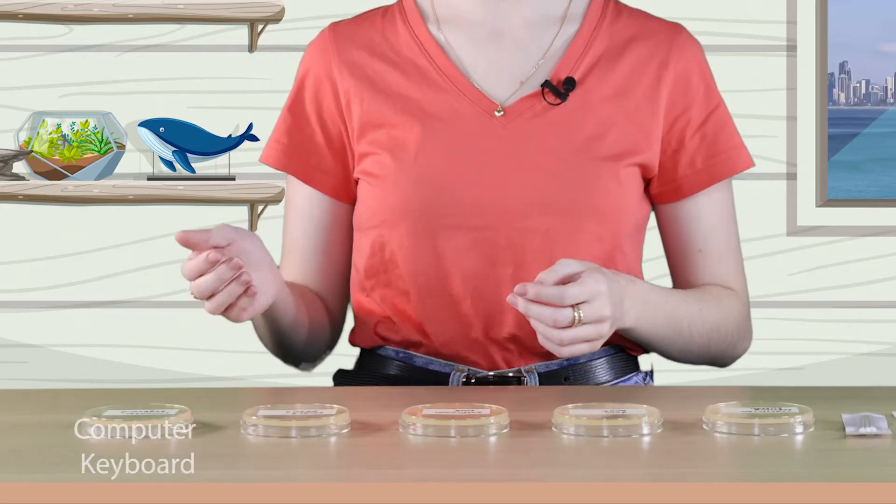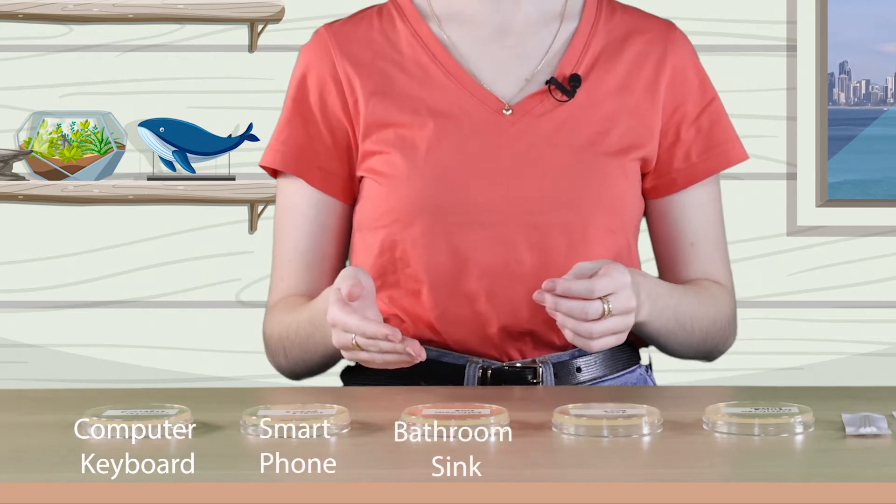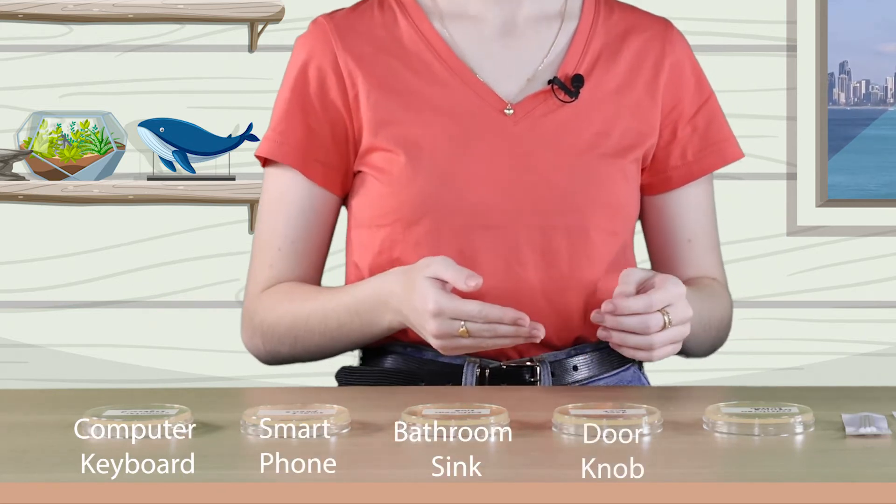We're going to take samples from some common surfaces around the Lighthouse Lab area and watch the bacteria grow and develop. I've labelled each agar plate. We're going to be sampling a computer keyboard, a smartphone, a bathroom sink, a doorknob and a pedestrian crossing button.